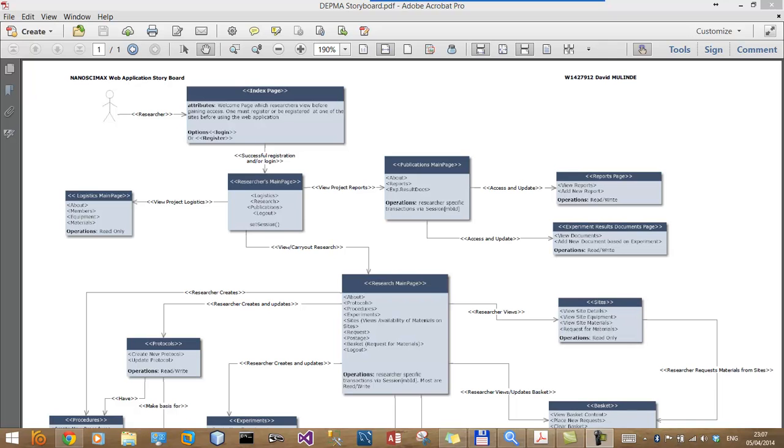experimental protocol. An experimental protocol is a written procedural method for the design and implementation of the experiment. It specifies the pieces of equipment and materials to be used.